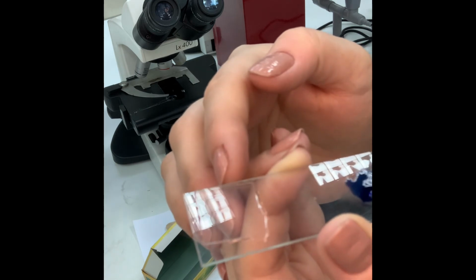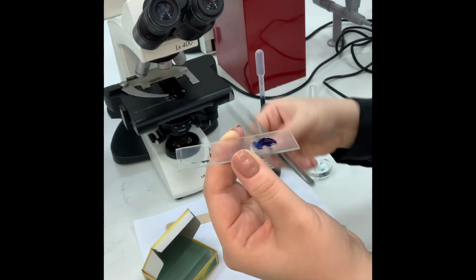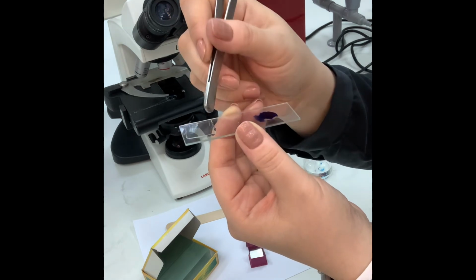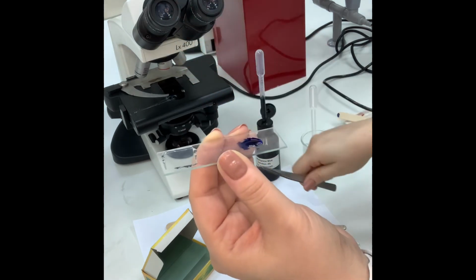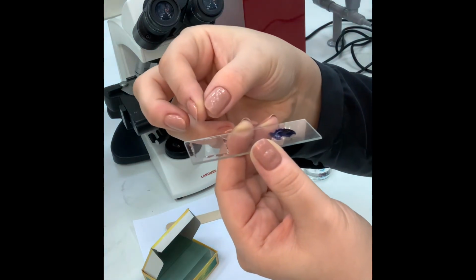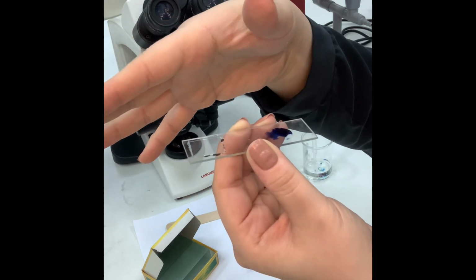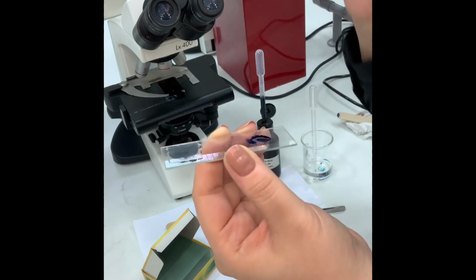Clear, no air bubbles. If sometimes you see one or two air bubbles, with the help of the tweezers, or a pen, you can very gently just tap, very simple, to remove the air bubble. But when you tilt it and put it very slowly on top, you won't create any air bubbles. If you drop this cover slip, there will be tons of air bubbles that will really annoy you under the microscope.